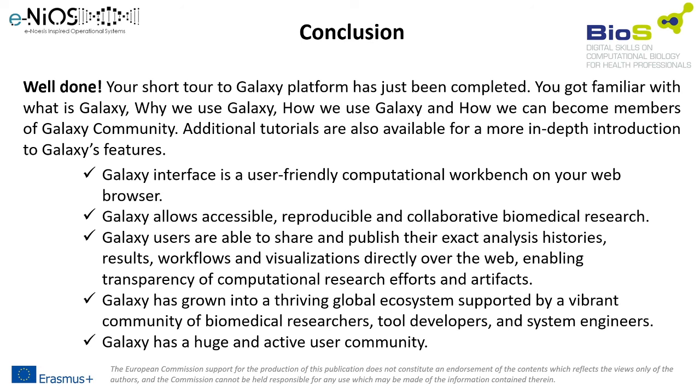Galaxy users are able to share and publish their exact analysis histories, results, workflows, and visualizations directly over the web, enabling transparency of computational research efforts and artifacts. Galaxy has grown into a thriving global ecosystem supported by a vibrant community of biomedical researchers, tool developers, and system engineers. And Galaxy has a huge and active user community.